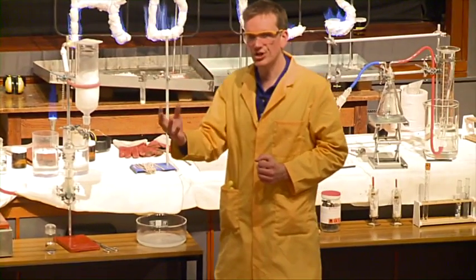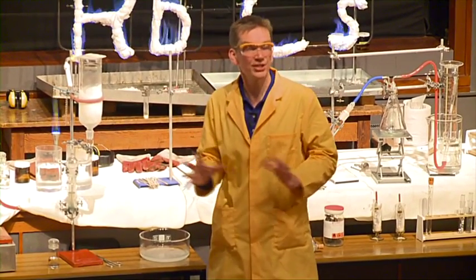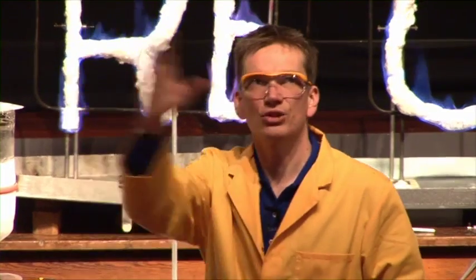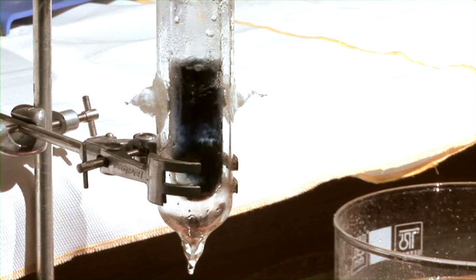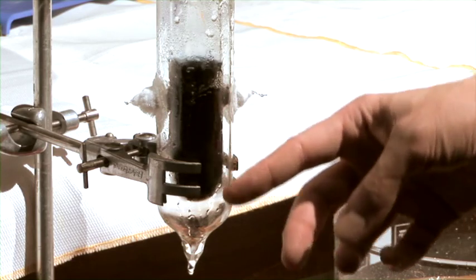So we're allowing the electron to come away. This is the outermost electron, and it doesn't matter which metal we're using here, any of these would give rise to this same blue colour, thought to be a solvated electron moving around in the ammonia.